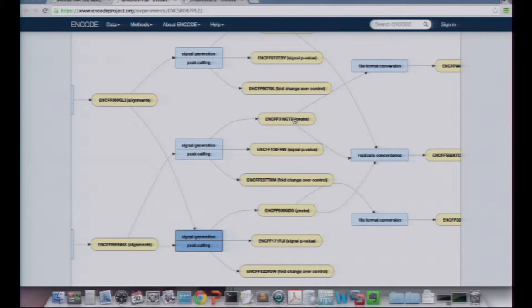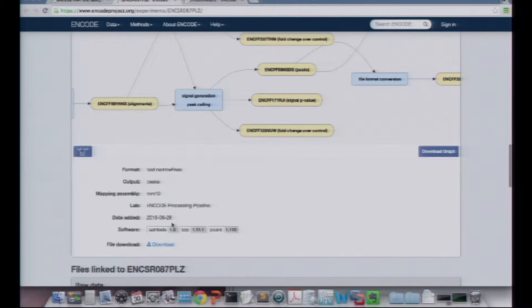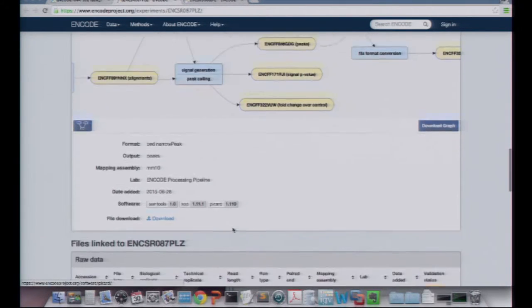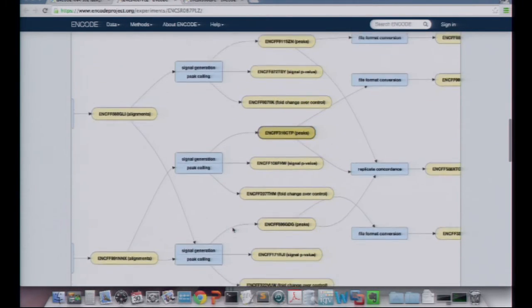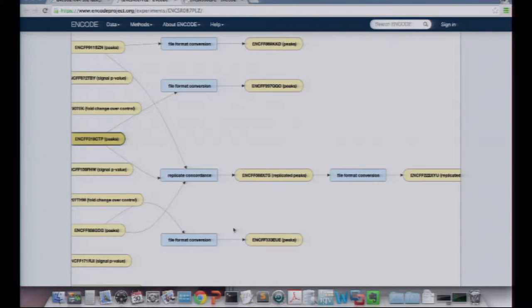You can click on each one of these files. Clicking on one at random and scrolling down, you get additional metadata about that file as well as a link to download it. What we're trying to accomplish on this page is to show you how the files were generated and give you direct access to them one by one.